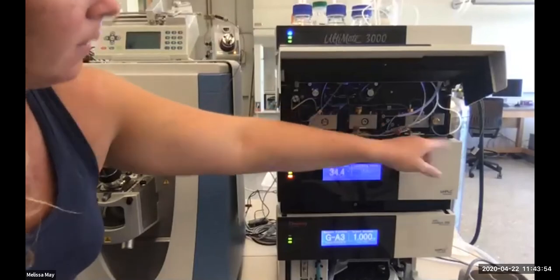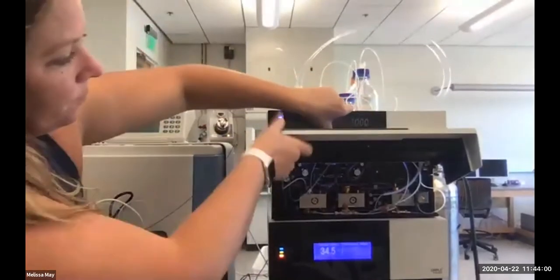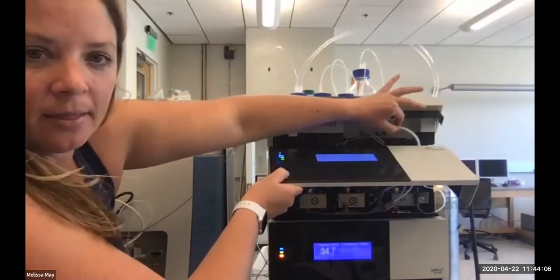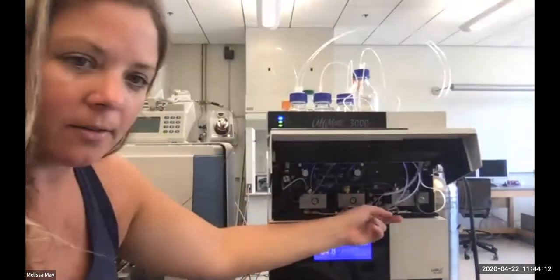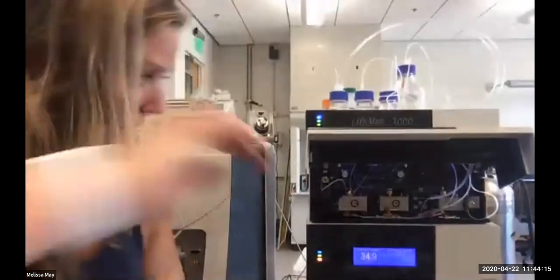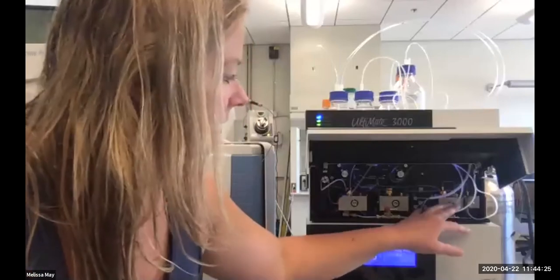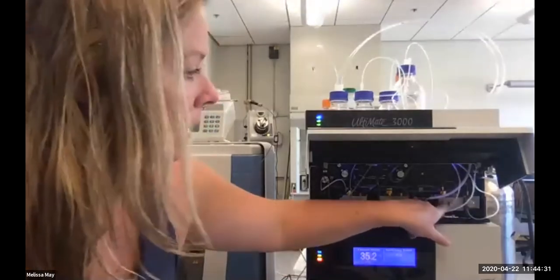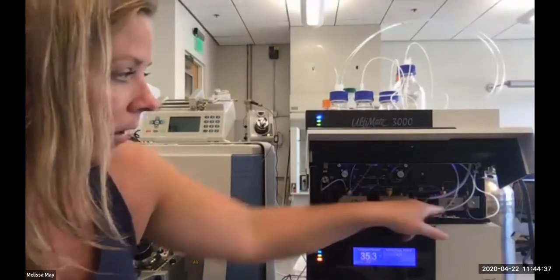For the loading pump, if I were to follow, so these are my loading buffers. They're going to come into the degasser up here, and then this is going to leave the degasser and input solvent into these three ports, okay? So there's little connectors that say A, B, and C. And then these, if you look closely, which is kind of hard to see because there's a lot of hardware in here, these are connected to this pump block, okay? So this is the loading pump block. This should be calibrated. You should never actually have to touch this part.